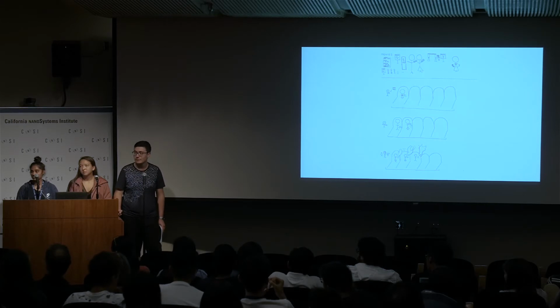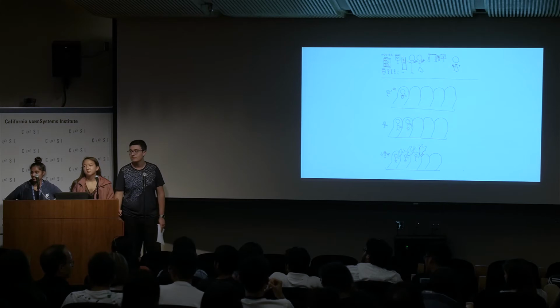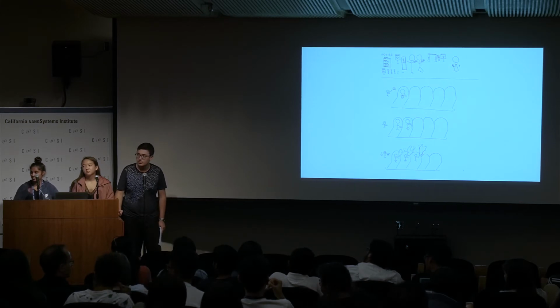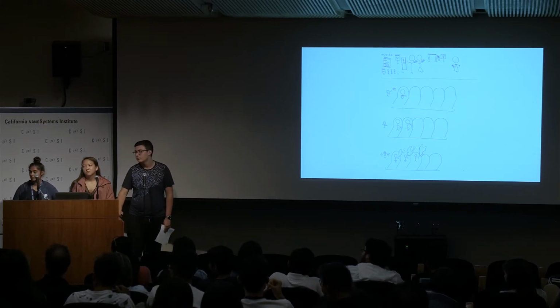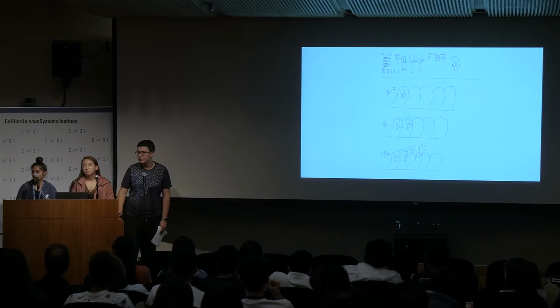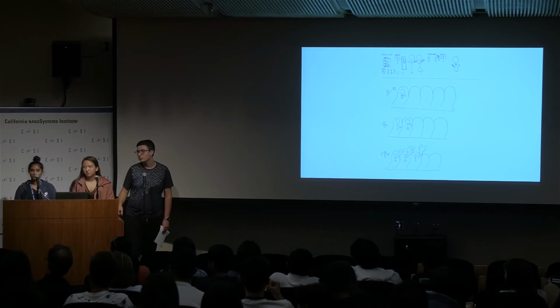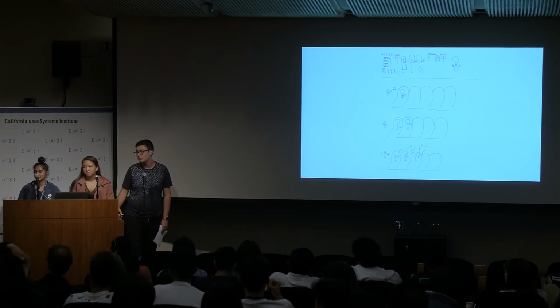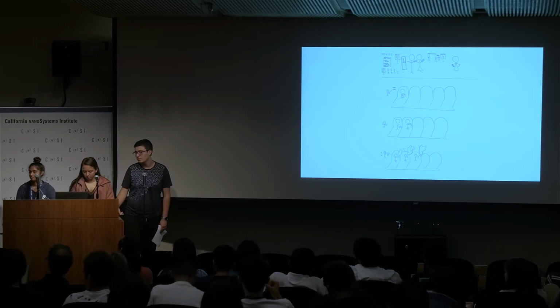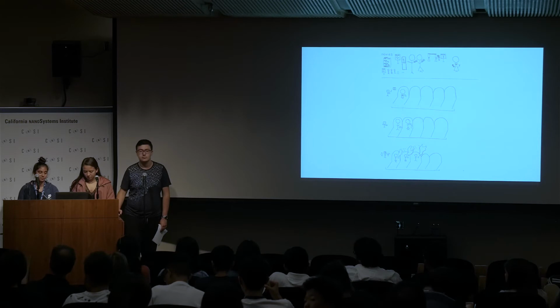What do living things do in general? They respirate, that's one thing. What else does life do? Multiply? Multiply, right? So what is the yeast also doing that could be counteracting the effect of them being killed off? Reproducing, right? So even if bulk silver can do some damage, it could be that the yeast is just reproducing at a greater rate, so that as a whole it counteracts the damage that any individual death of yeast might do to them as a colony.